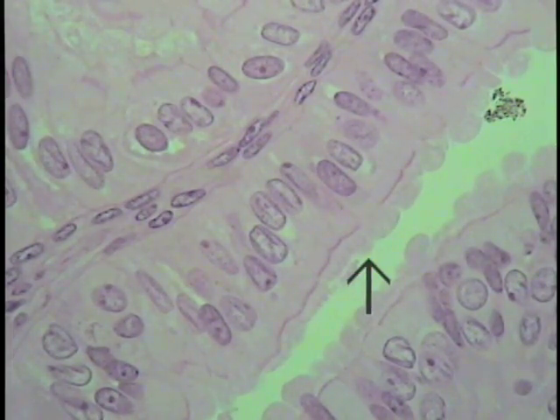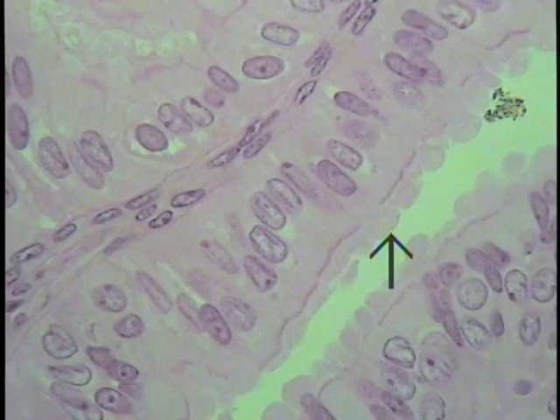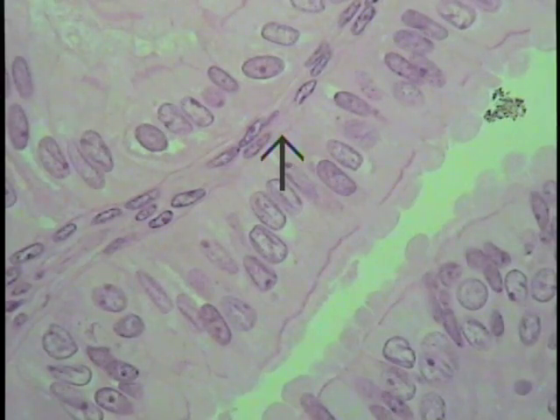Also within this lining epithelium are simple columnar cells modified for secretion that do not show cilia or the basal bodies. One is located here, and you can see how the cytoplasm has extended or ballooned out into the lumen of the oviduct. So its apical extent would be here, the nucleus located here, and its base would be resting on the basement membrane at this location.